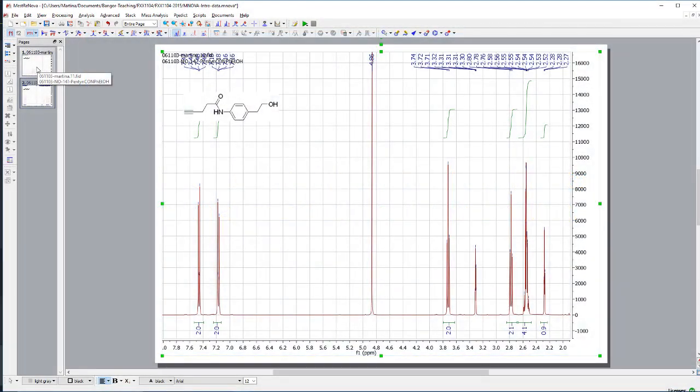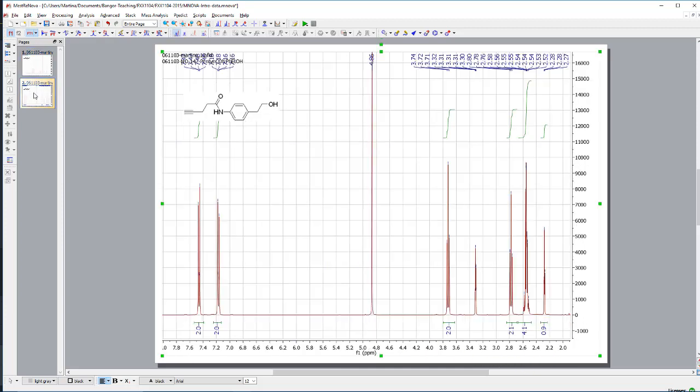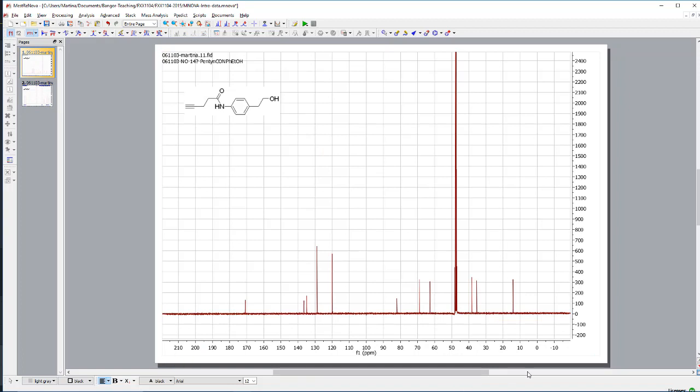In this tutorial I would like to show you also what to do with the carbon-13 spectrum. For this purpose I have a carbon-13 spectrum here already from the same compound, and now everything looks completely different. First of all, we have a completely different scale. If I go back to the other one, here we had a scale somewhere between 0 and 10 or 15, and now we are going to the hundreds. So my spectrum goes at the moment from -20 up to +220.